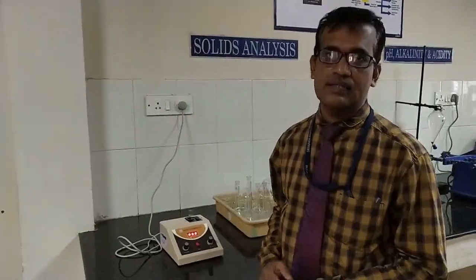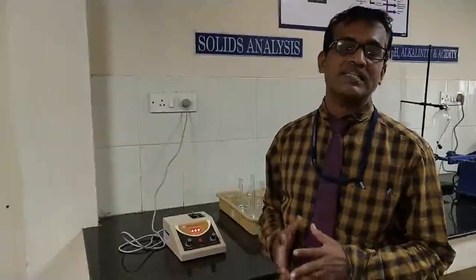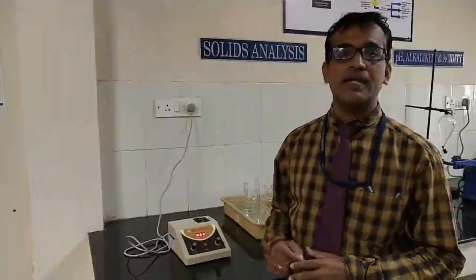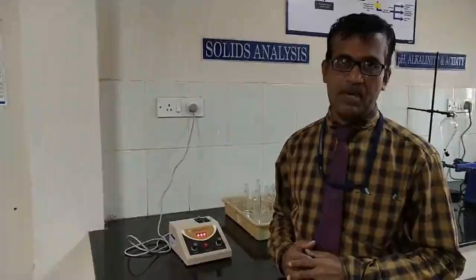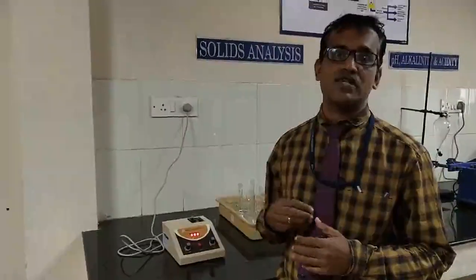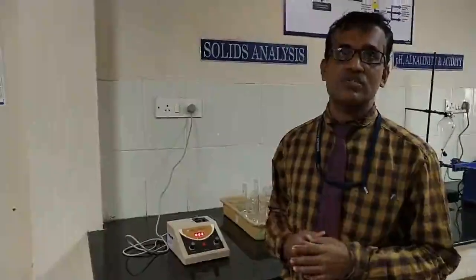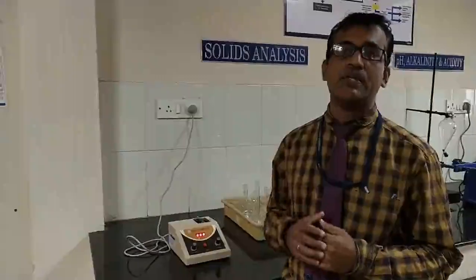Conduct the colorimeter experiment. The colorimeter is an instrument used to measure the inorganic content present in a wastewater sample or industrial wastewater sample. A particular inorganic component gives a specific color when it dissolves in water, and that color has a particular wavelength.